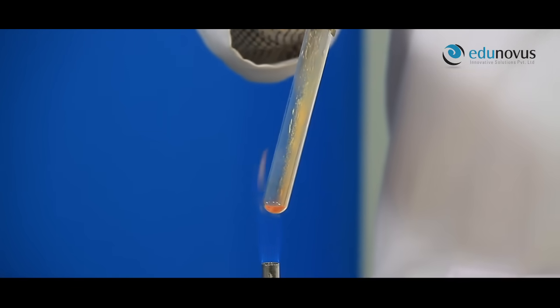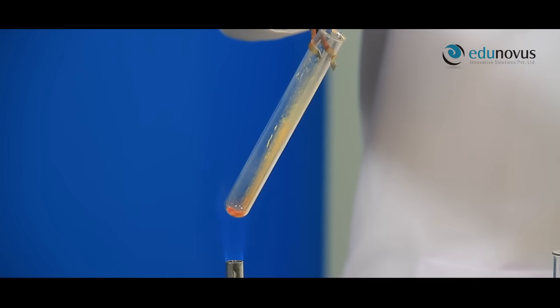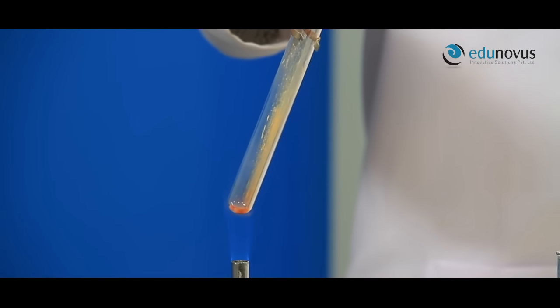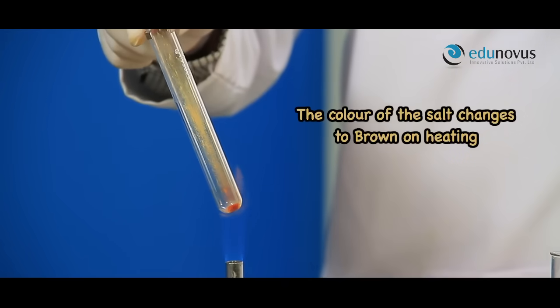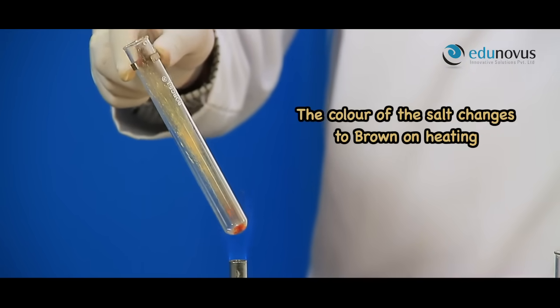You can see the change in color of the salt from yellow to brown. In this way, if the salt is brown when hot and yellow when cold, it infers that the given salt may contain lead cation.